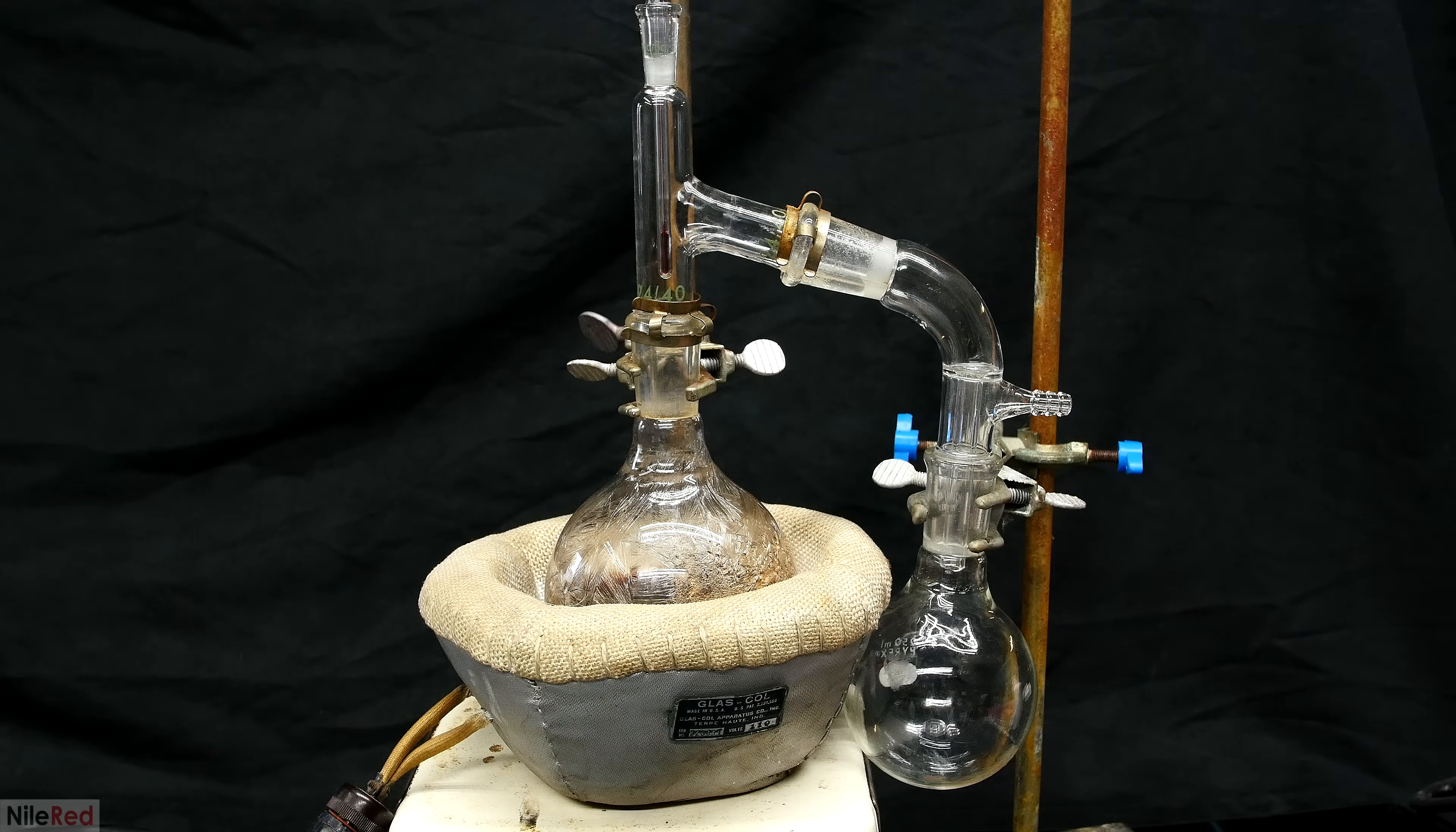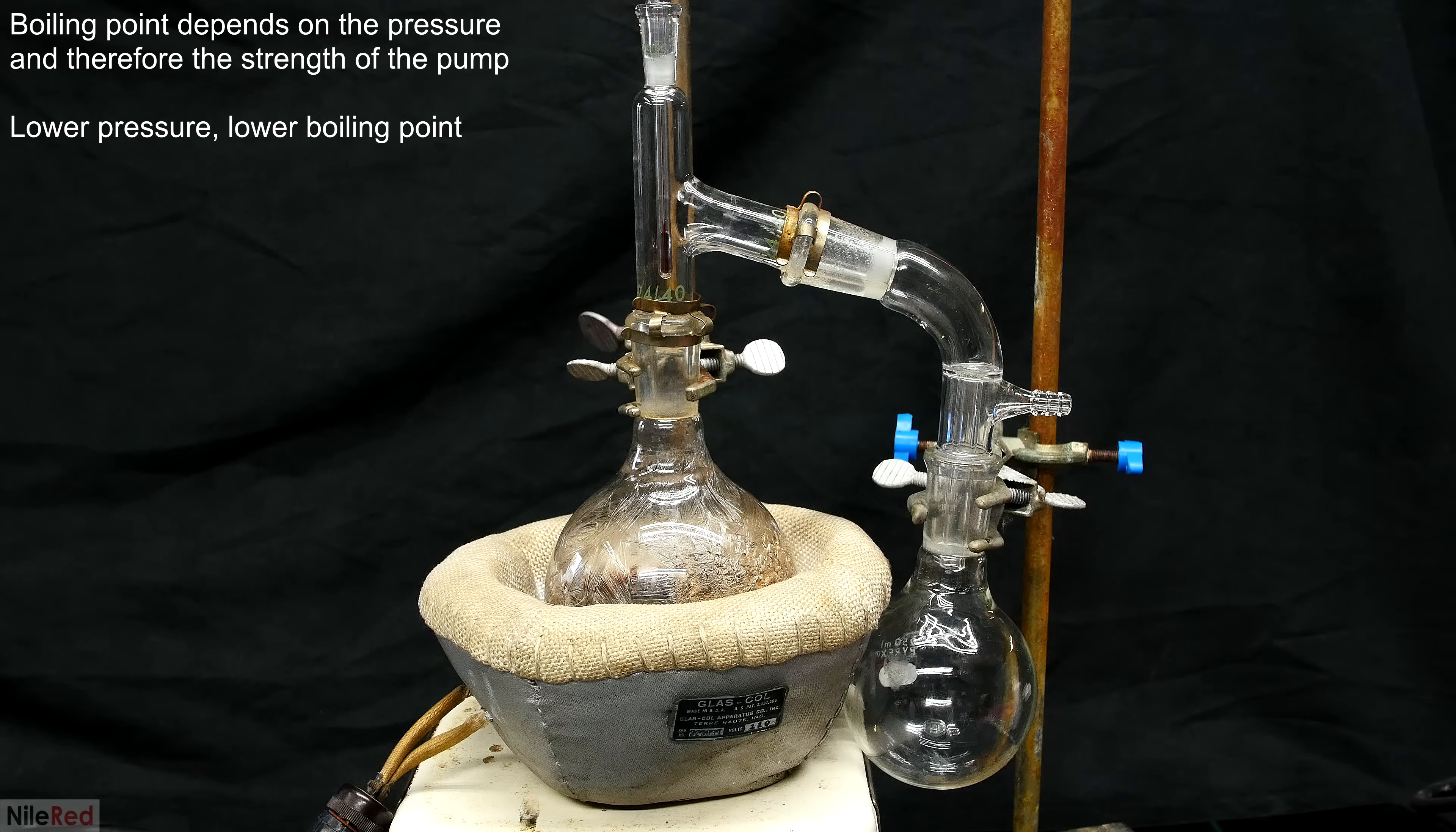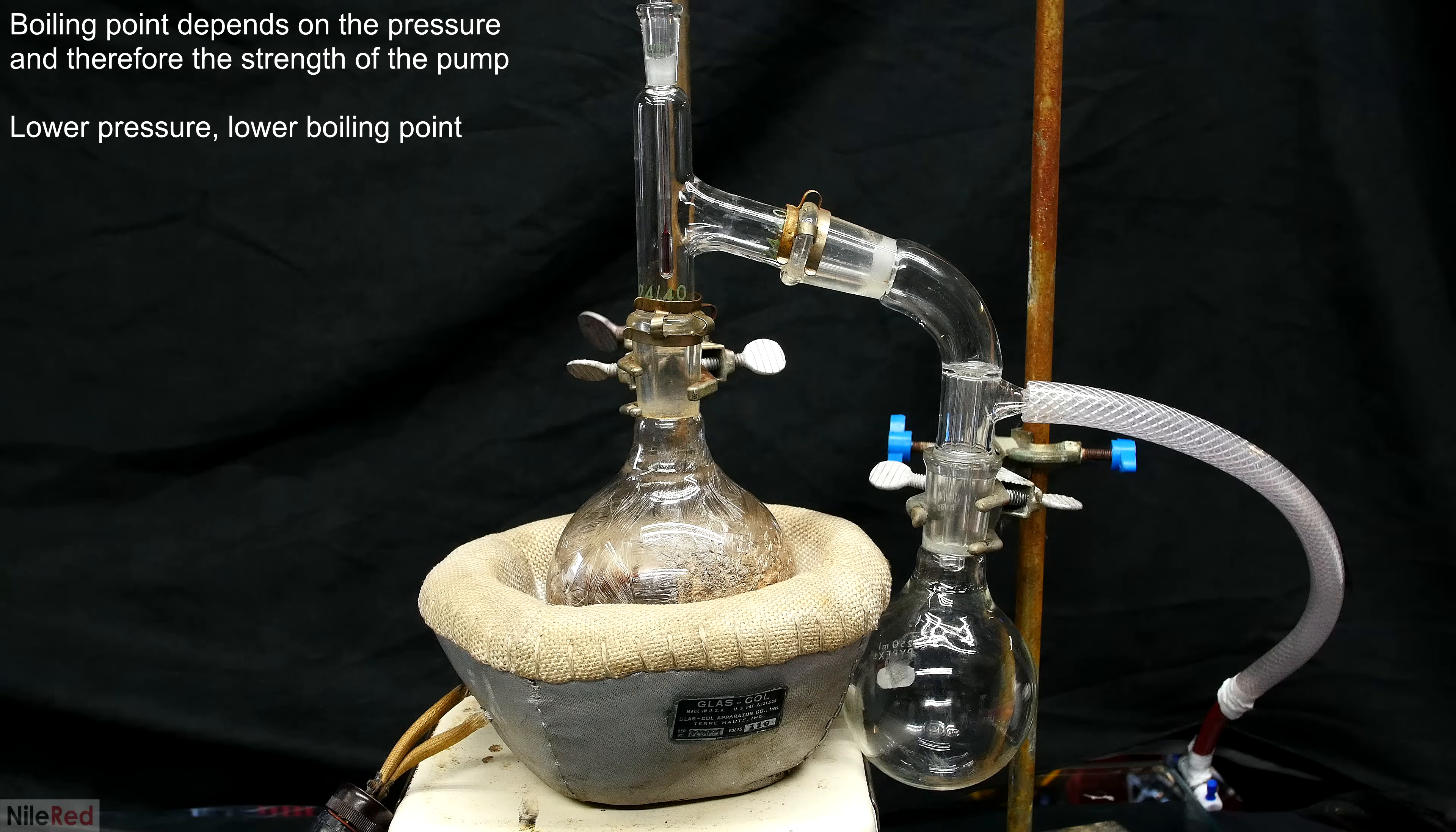To get a better separation and a potentially cleaner product, you could also use a fractional column. We use a vacuum distillation here for two main reasons. The first one being that it greatly reduces the boiling point of the phenol, and it also prevents the phenol from reacting with oxygen.